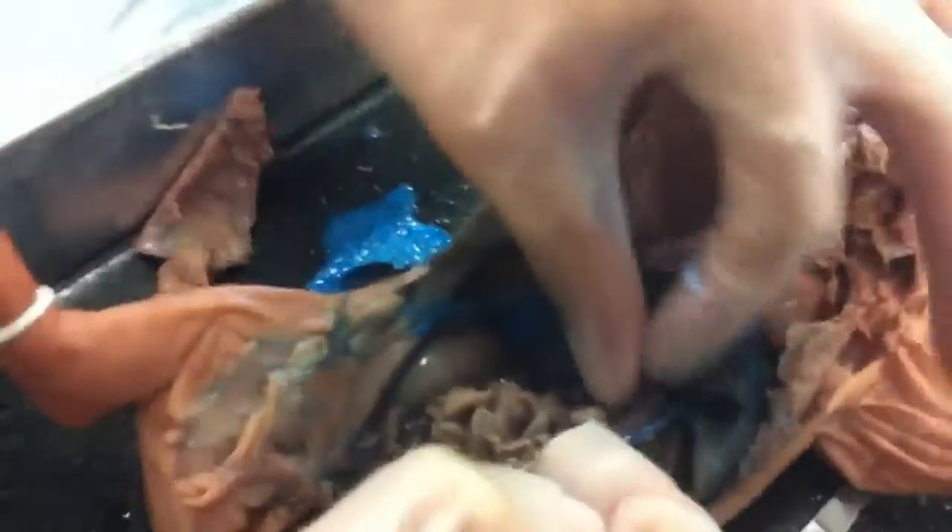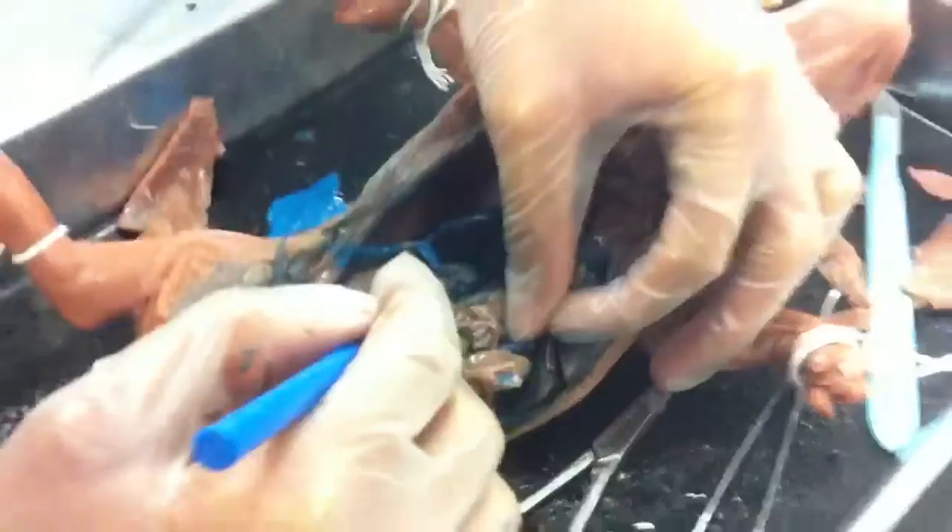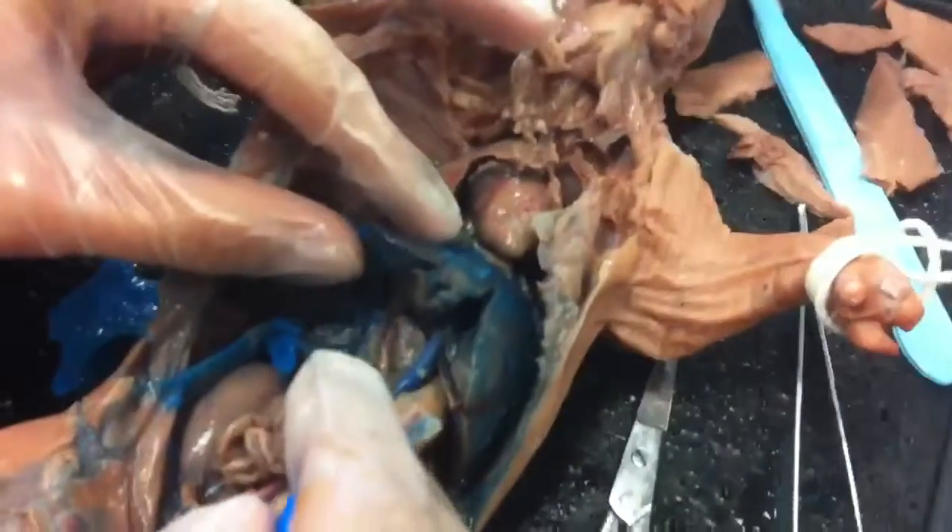And then the pancreas — it took us forever to find. There's the pancreas right here; it's the one part that looks rough. And then the pancreatic duct is this little part next to the pancreas that connects two parts — connects the right and the right. The common bile duct is actually this part right here.